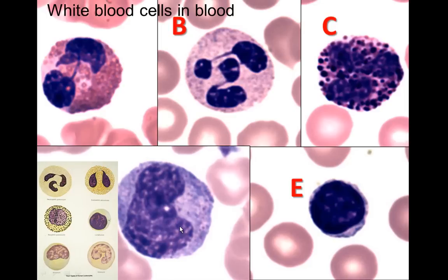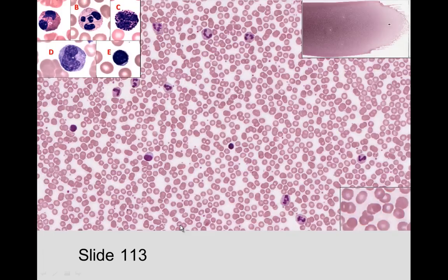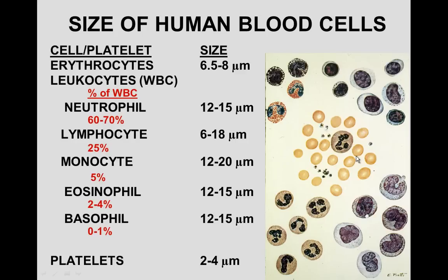Looking at slide 113 with the atlas as reference, we can identify neutrophils, a monocyte, and lymphocytes. Looking at human blood and relative sizes, red blood cells are the smallest. Among white blood cells, neutrophils, monocytes, eosinophils, and basophils are about the same size and larger than lymphocytes, except when you have a large lymphocyte, which can be quite large.